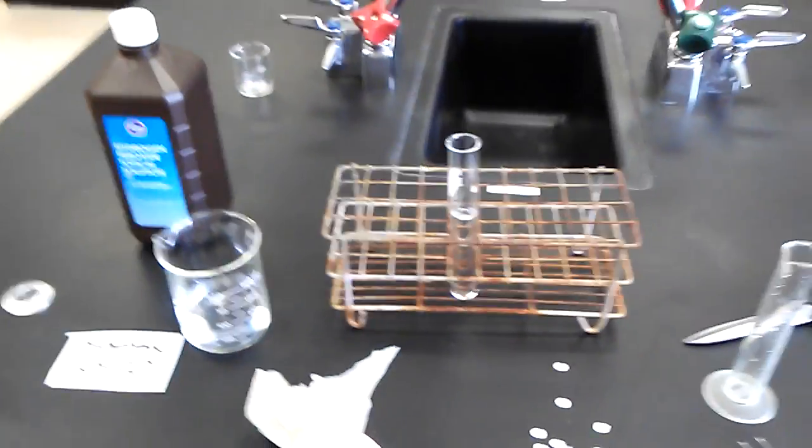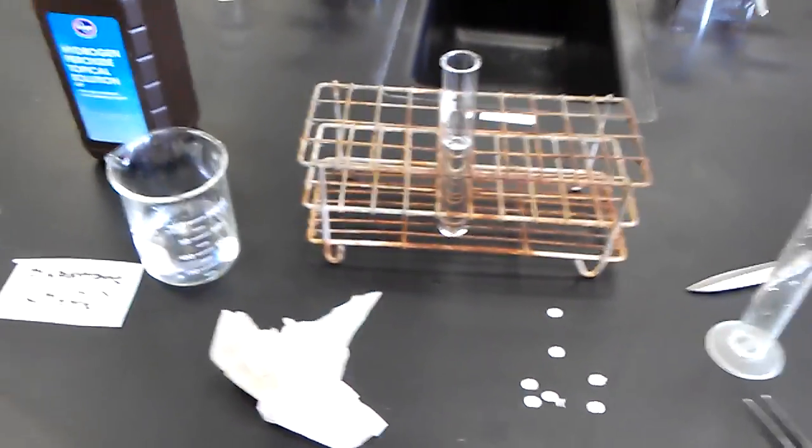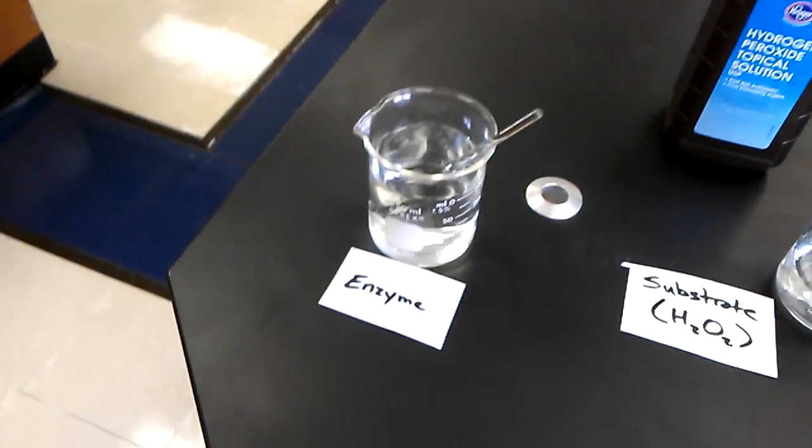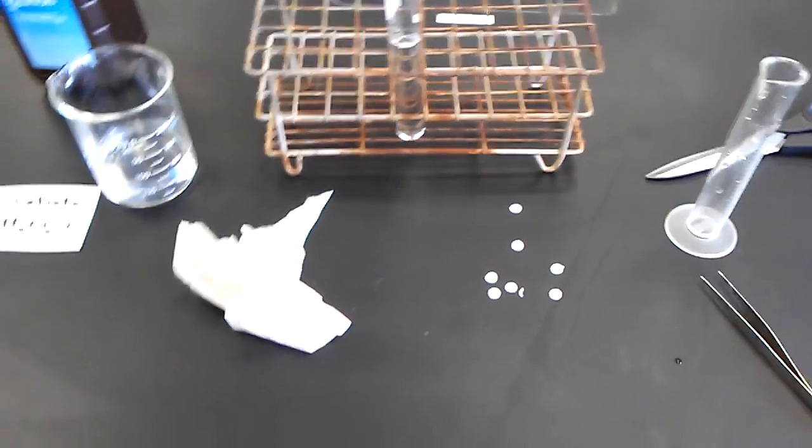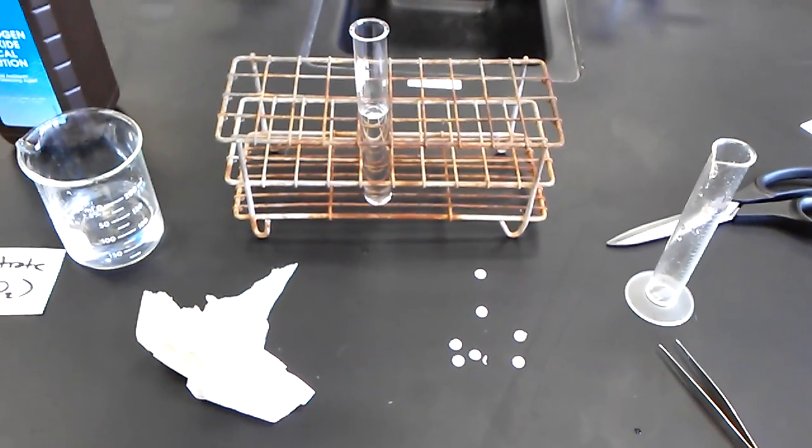In this experiment, you will perform essentially the same concept with different manipulations of substrate concentration, enzyme concentration, temperature, and pH. And that's it. This is the basic concept for how you will do your experiment.